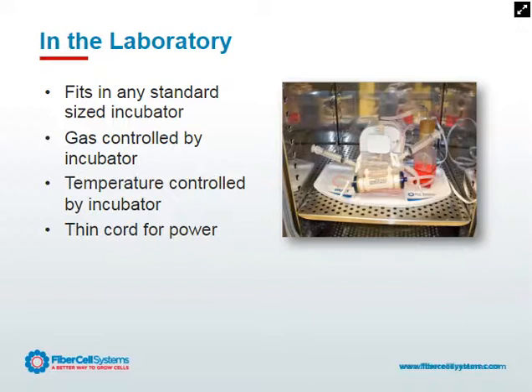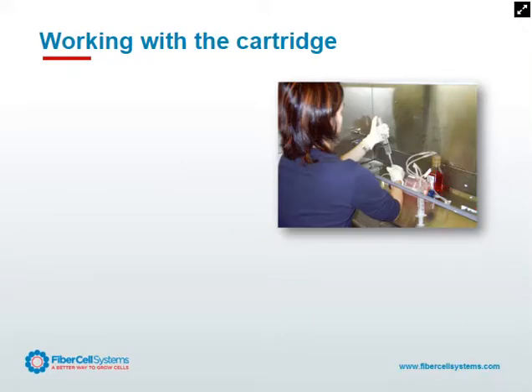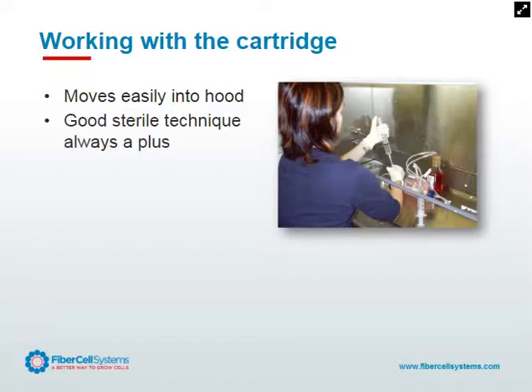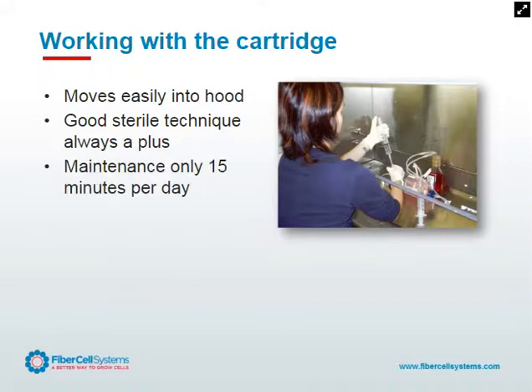It's very convenient to put inside the incubator and take out again. When working with the cartridge, we can pull it out of the Duet pump and move it into the hood. It's both the easiest and most difficult process to contaminate a cartridge. While it's outside of the hood, it's going to be sealed; when it's inside the hood, it's very important to utilize good sterile technique. Maintenance is only 15 minutes a day — we just measure the glucose and harvest our product. In this example, this young lady is not wearing a lab coat, so we want to be sure to follow good sterile technique whenever we're working with the cartridge.